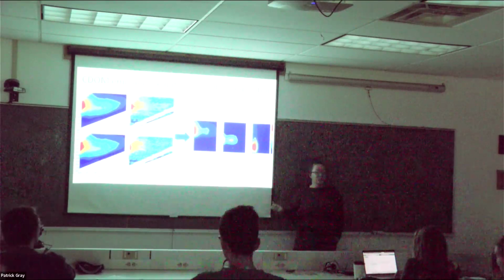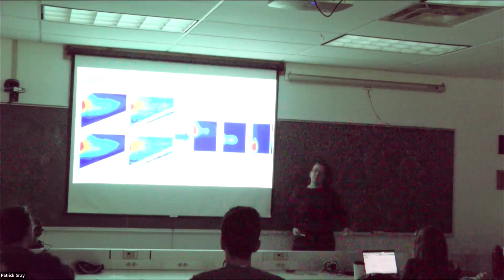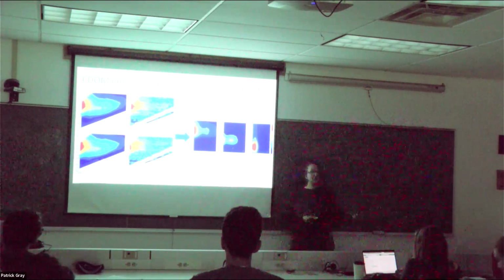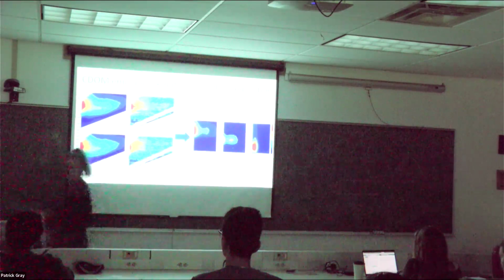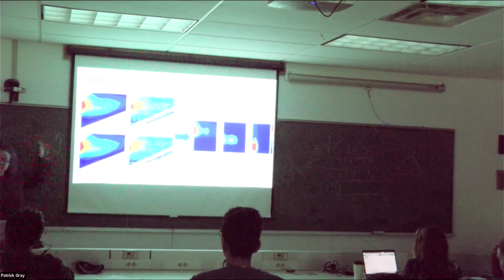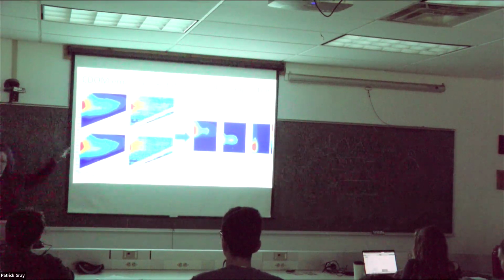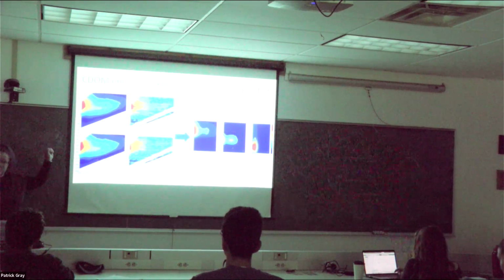So it's really cool, because now you can start looking at these emission and excitation spectra to say what CDOM is in the water and try to relate it to the processes in your ecosystem. And where do these sources of the CDOM come from? Does this make more sense now in comparison to what I was saying about excitation emission before? Everybody's nodding, Tom is still concerned.